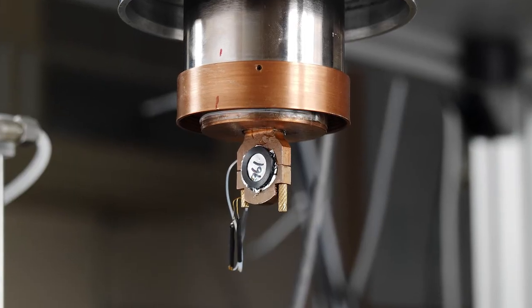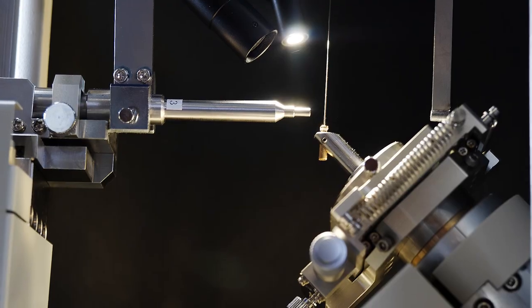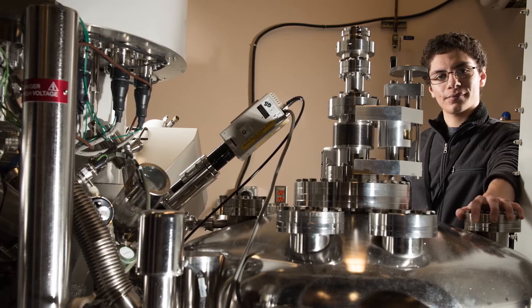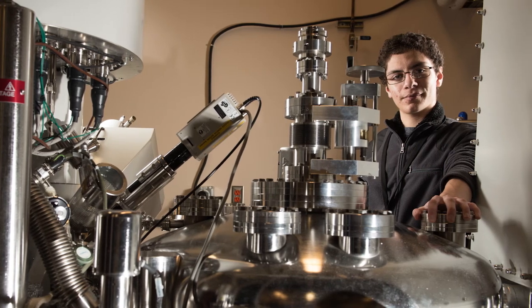It's often the case that the data that we obtained from ETEM have to be complemented with results from other techniques such as Mössbauer spectroscopy, X-ray diffraction, or XPS to gain complete understanding of the materials behavior.